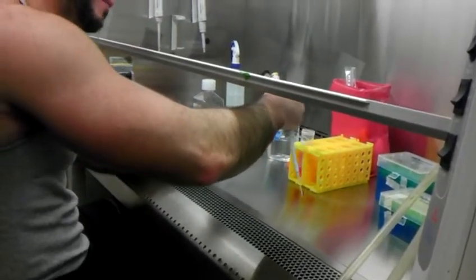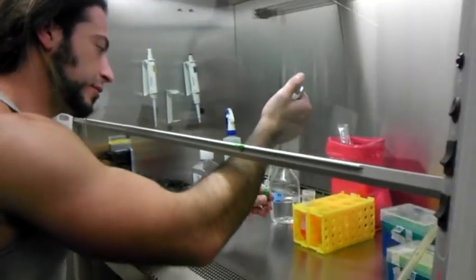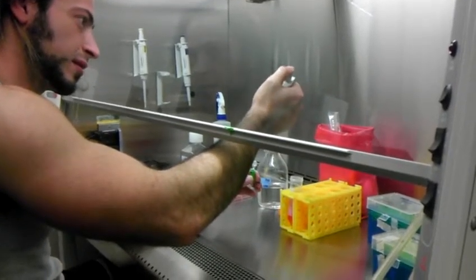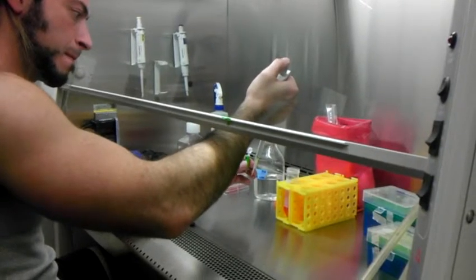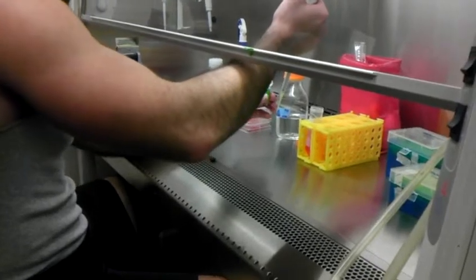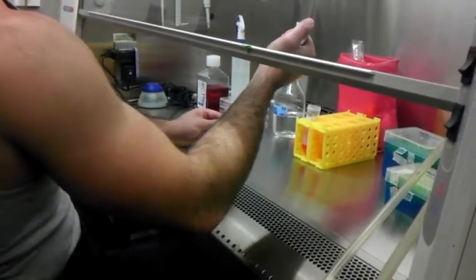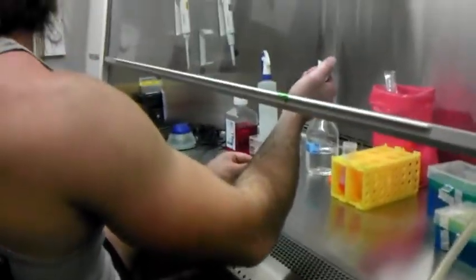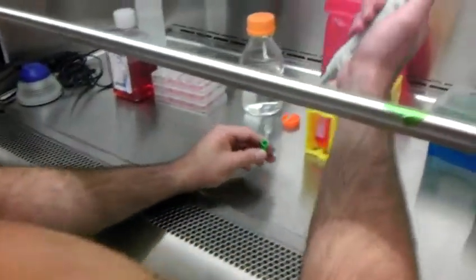Shoot 20.8 microliters of the reporter plasmid into the concoction over here. Do you want to pipette it up and down? Pipette it up and down slowly. Very slowly. If you do it too hard, it'll screw it up too. After you add the plasmid, go up and down slowly.